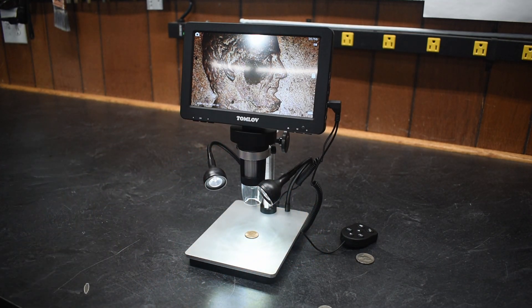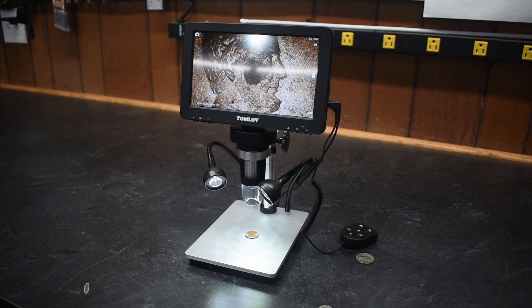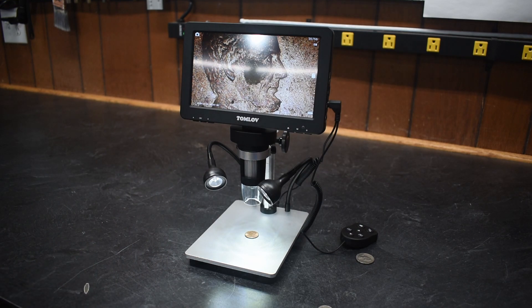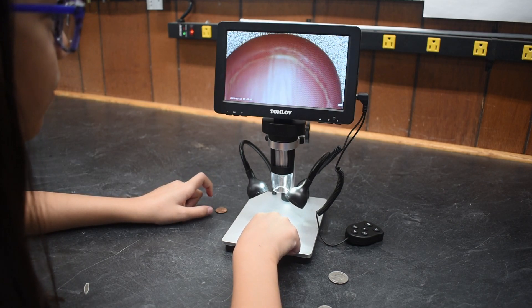Okay, I think that's Obama — no, no, no. That's Abraham Lincoln, yes, Abraham Lincoln, with some sort of disfigurement on his face there. Oh, he's blushing. This is my nail — yeah, it is very short.